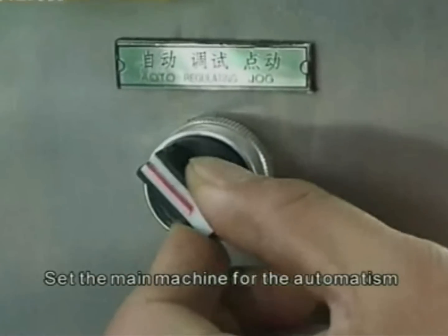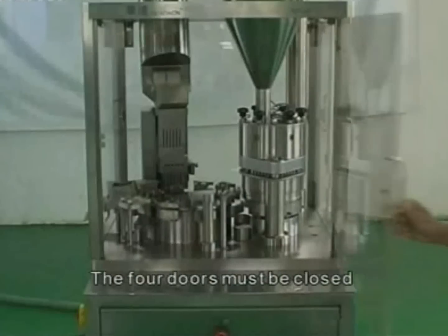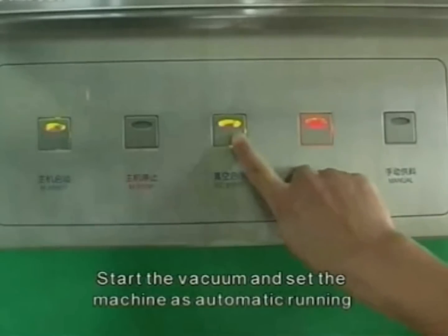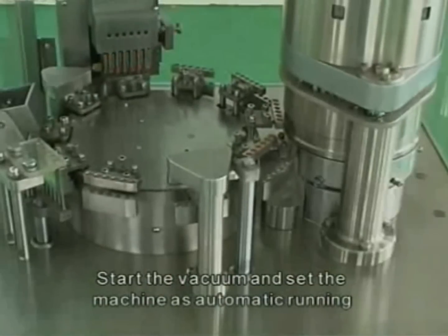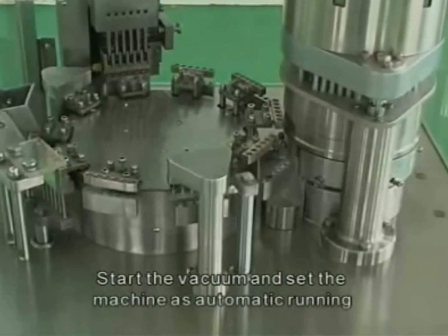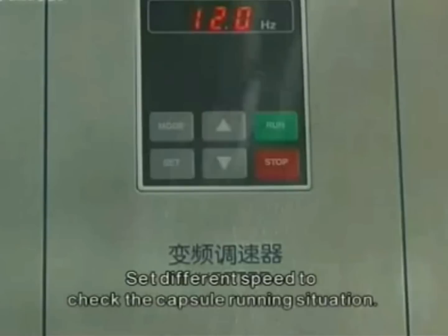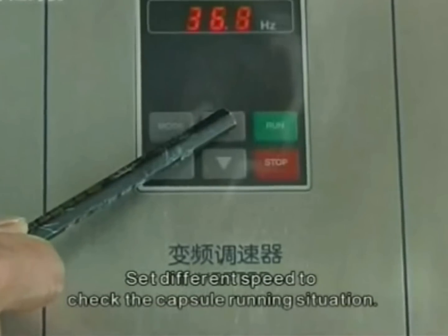Set the main machine to automatic mode — the four doors must be closed. Start the vacuum and set the machine as automatic running. Set different speeds to check the capsule running situation.